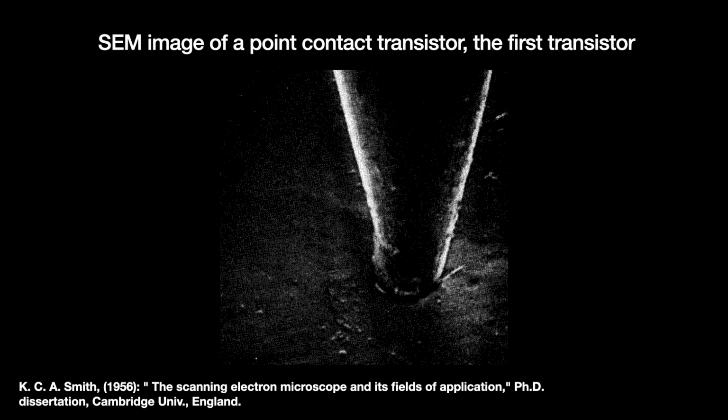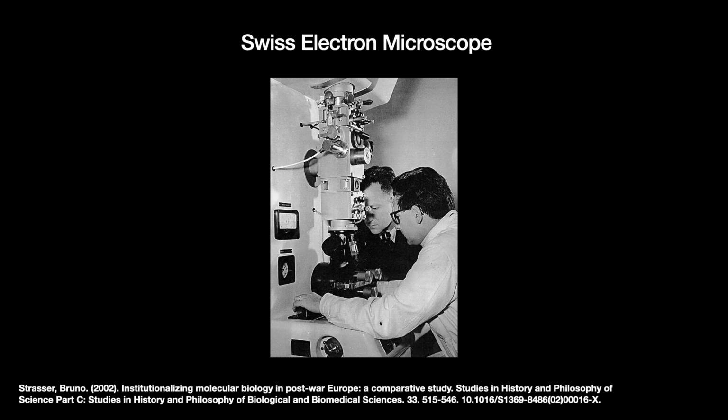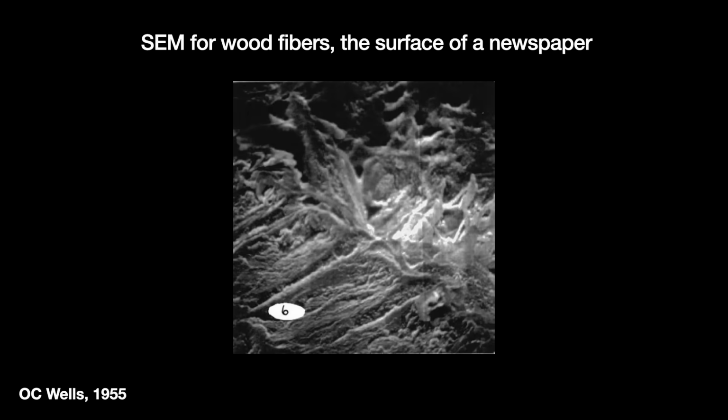questioned its commercial viability. The scanning electron microscope offered far less resolution than its sibling, the transmission electron microscope, hundreds of angstroms rather than the latter's 10 or 20 angstroms. On the other hand, the SEM did not require the long and tedious preparation of replicas. This not only made it more convenient to use, but also suited items like fibers, often susceptible to burning whilst being prepared. Furthermore, SEM images have that fantastic and distinctive depth of field. Can't dispute that these SEM images just look amazing.